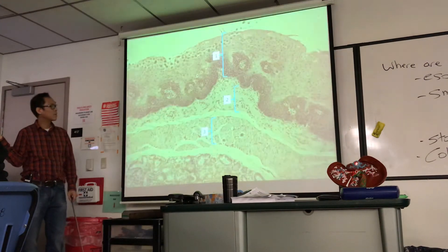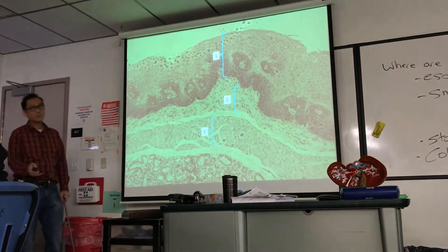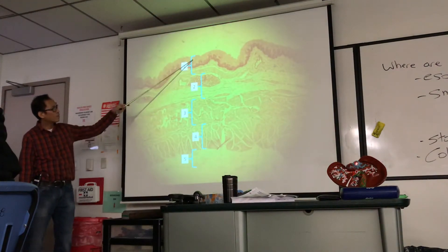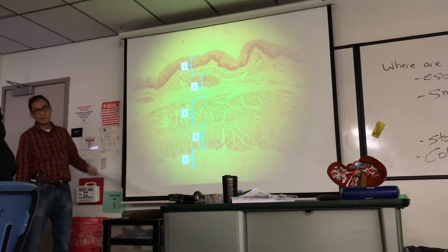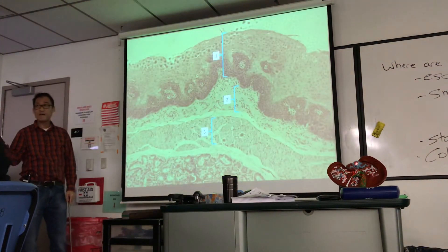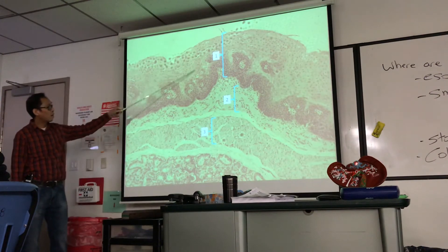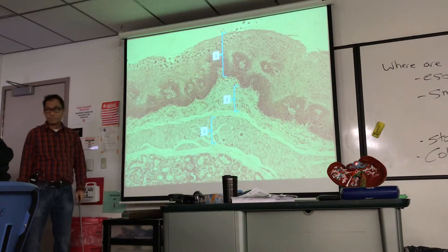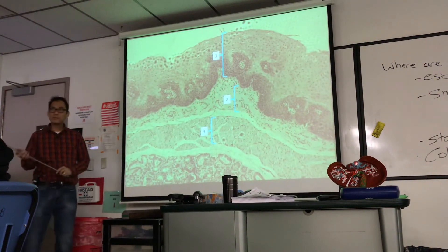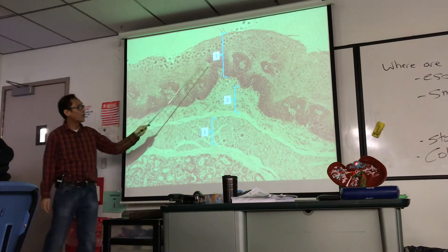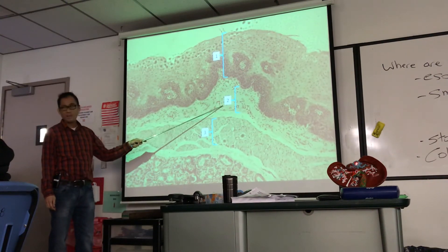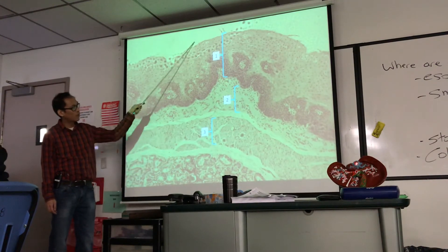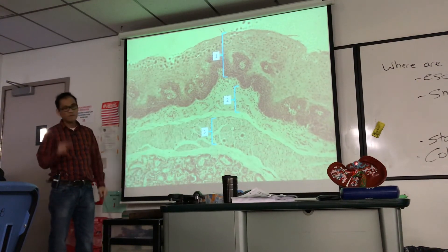Here it is unlabeled to help you study, and here is a closer-up view. Zooming in on the esophagus — this is all mucosa, broken down into: number one, an epithelium (it's a stratified squamous epithelium); number two, connective tissue — the lamina propria; and number three, muscularis mucosa. So one, two, and three are all mucosa of the esophagus. Here you see a bit of submucosa.